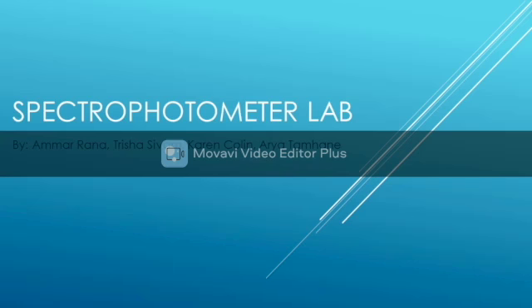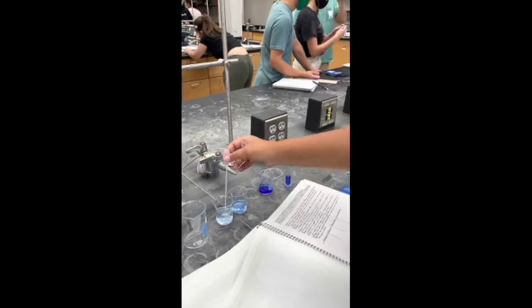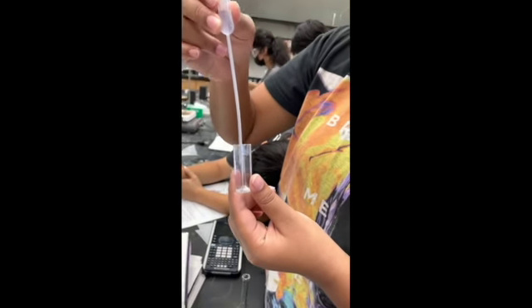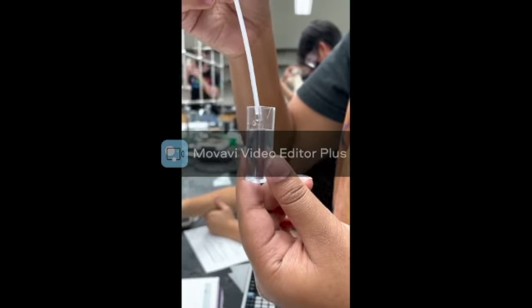This video will show how to use the spectrophotometer to measure the amount of absorption in dilutions. A copper sulfate solution will be used during this lab. We're now going to transfer the solution into the cuvette. We're going to take a bit in our pipette here, and we're going to fill it up to the line. We're going to repeat this for all of our dilutions and the water and the stock solution.